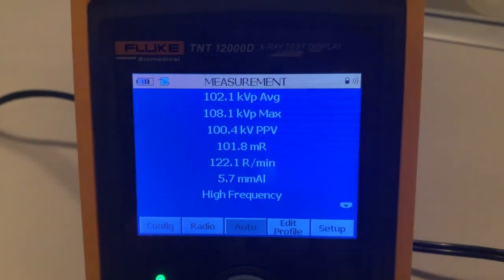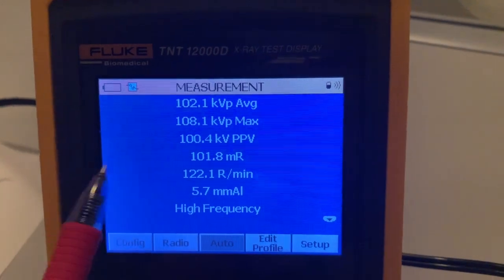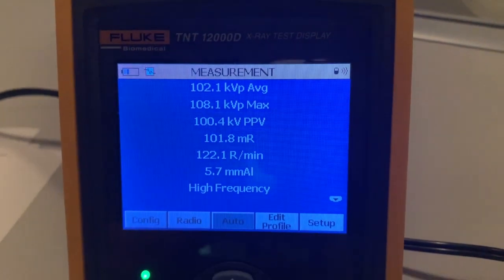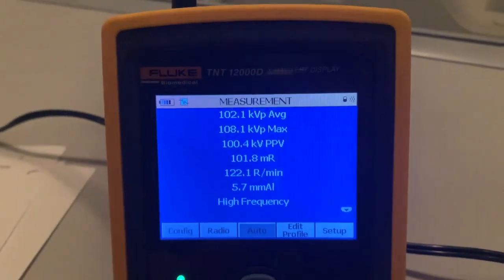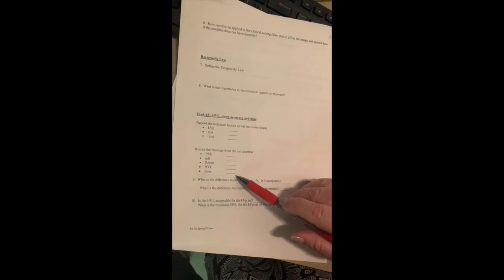So there we go. And then the milliseconds. Sorry, where did my milliseconds go? There we go, up here. Where's my milliseconds? Sorry, it's on the machine. Anyways, I'll go tell you in just a second. So the milliseconds were 50 because I set that up already. So sorry guys. Now we're gonna move on to group 2.